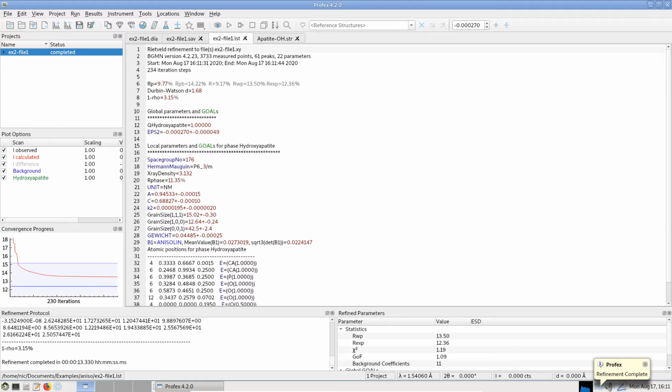And here we are back at the values more or less we got before. For the crystallite size, there is one more thing to consider. The value we get here represents the diameter of a sphere of an equivalent size.